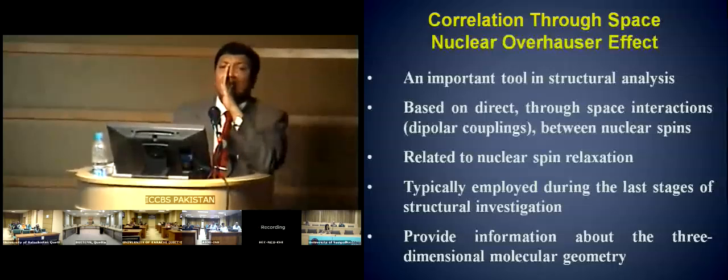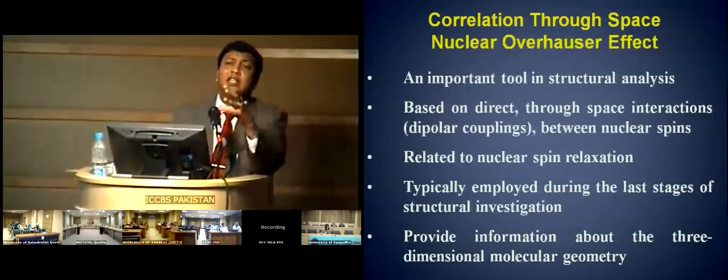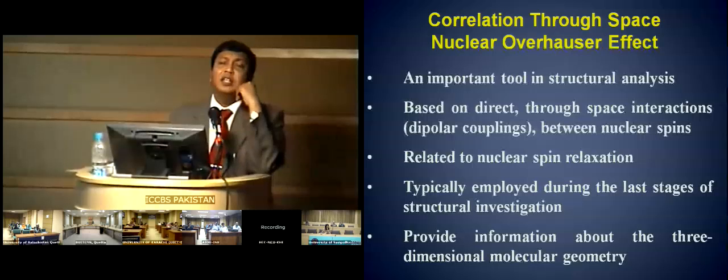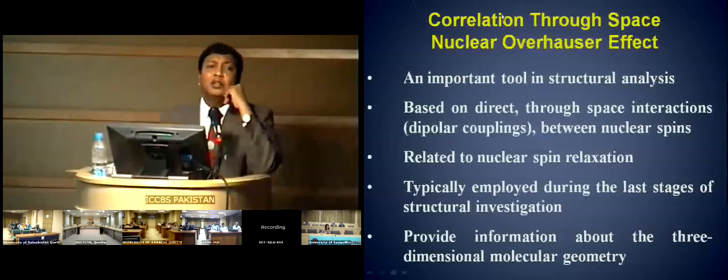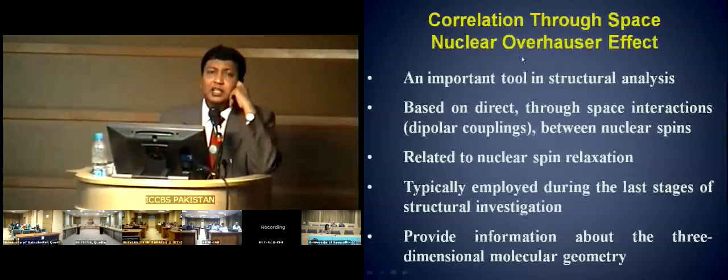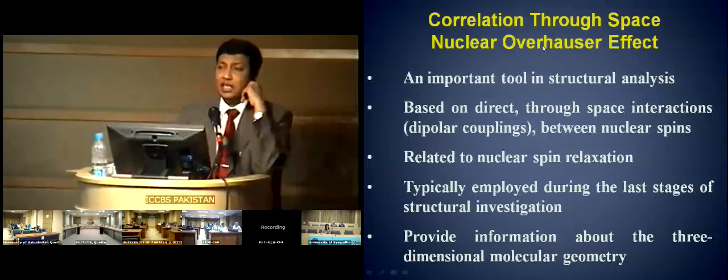What we have done until now is just technology, techniques, sequences, increase in sensitivity, putting bits and pieces together, looking into proton-proton coupling, looking into proton-proton coupling in the entire spin system, vicinal couplings, geminal couplings, proton-carbon couplings, carbon-carbon couplings, proton-carbon long-range couplings, but we have done nothing to understand the dimensionality.